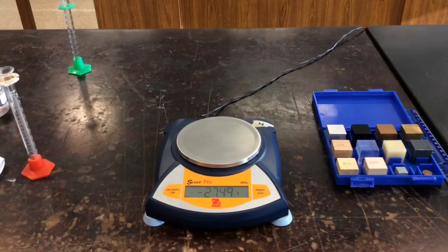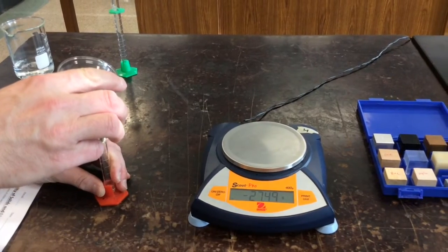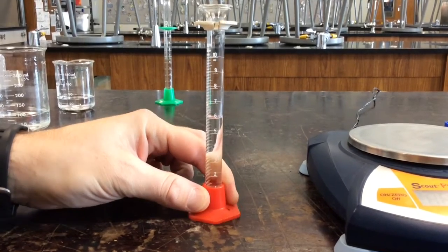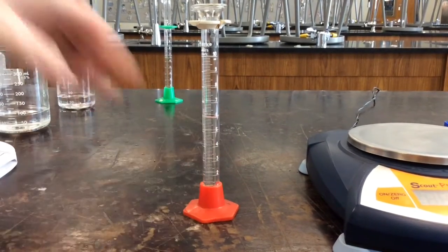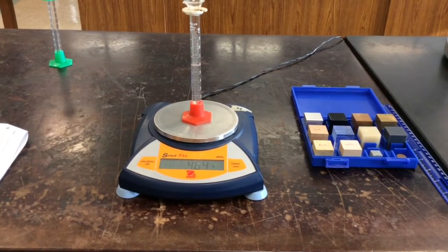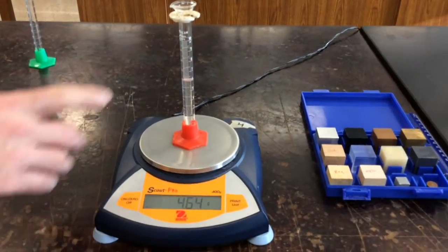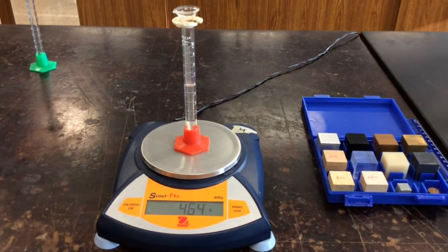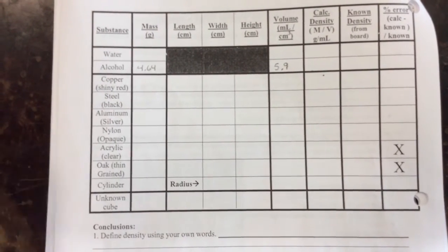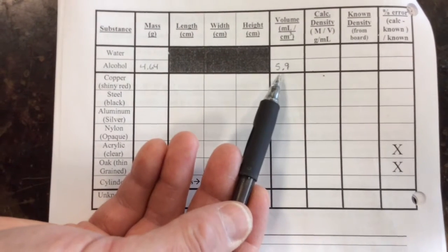The first liquid that we're going to use is going to be alcohol. You will pour yourself between 5 and 10 milliliters of the liquid. The volume in our graduated cylinder with alcohol is 5.9 milliliters. Once you've gotten your sample, you'll put the graduated cylinder back on your balance, and the mass that is showing on the balance should be the mass of your liquid inside the graduated cylinder. In this case, it's 4.64 grams. Place that data on your data table. The mass was 4.64 grams we got from our balance, and the volume of 5.9 milliliters we read directly from our graduated cylinder.